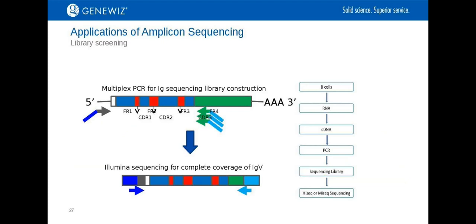So how do people use next-gen sequencing to analyze the natural repertoire? So most researchers are interested in knowing how the expression of different antibody genes change over time. Therefore, starting from total RNA, researchers can use gene-specific primers to reverse transcribe antibody genes. Then a PCR can be performed of the resulting first strand of cDNA to produce a product that could be sequenced on next-generation sequencers.